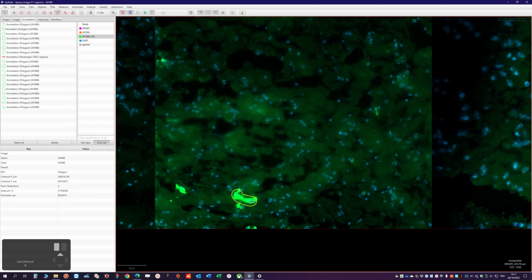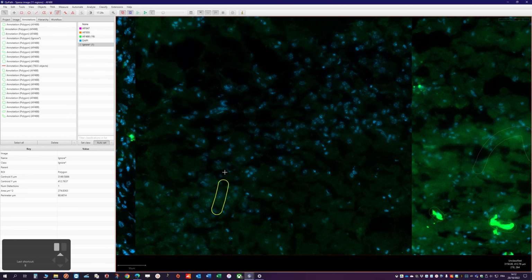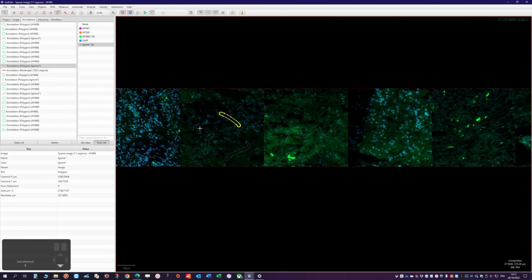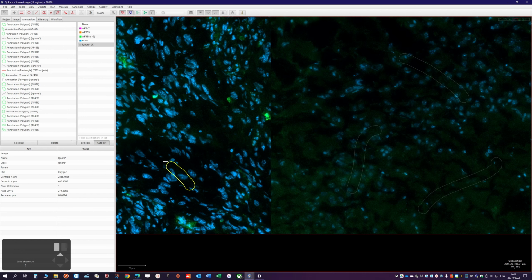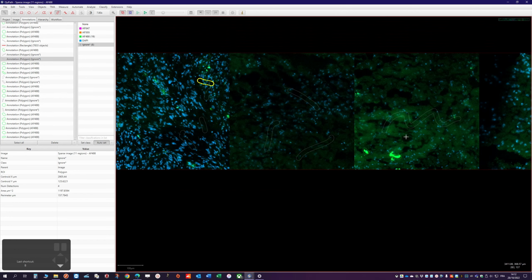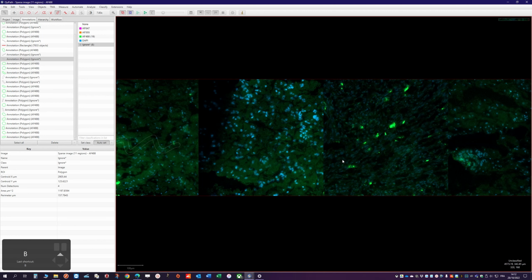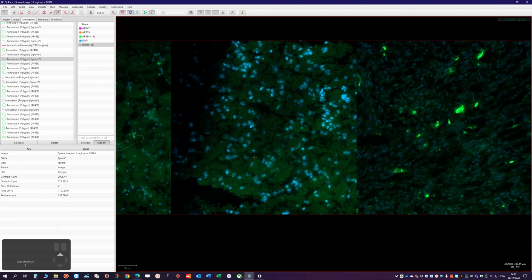So like that. And now we will switch to the other class, which is ignore, and we will draw regions that we consider as part of the background, like that. So it's important to include, like that, all the cases you will find.